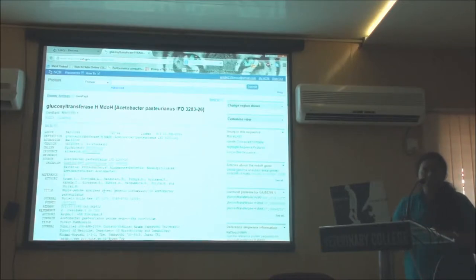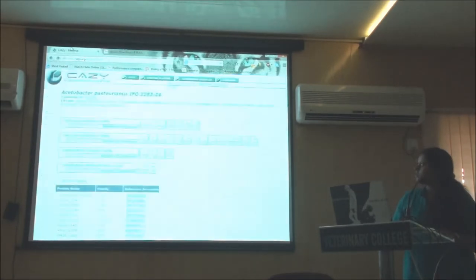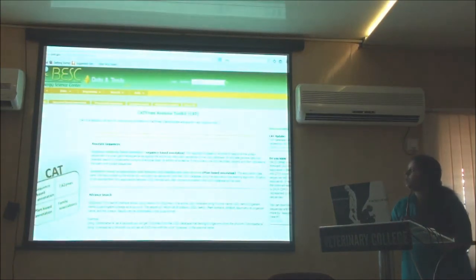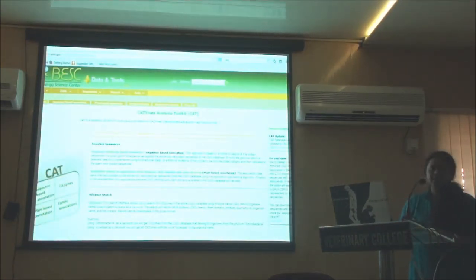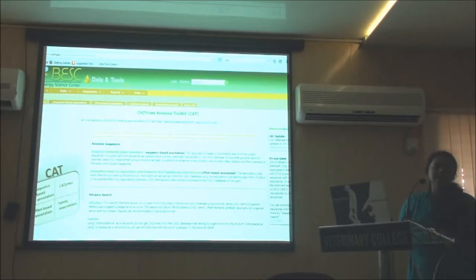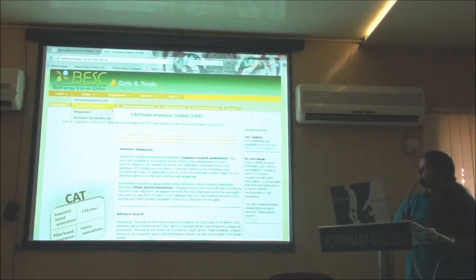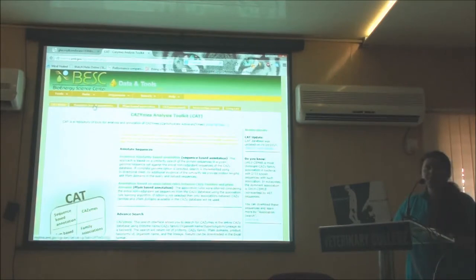Overall, CAZy is a very good database. If you play around with it you will get maximum information regarding any particular enzyme. We can get sequences annotated using sequence-based annotation as well as PFAM-based annotation from CAZy. The CAZy analysis toolkit is the prerequisite for CAZy annotations. If you type 'CAZy analysis toolkit,' this is the homepage. From here you can go for sequence-based annotation. There are many features: sequence-based, PFAM, CAZy search, association search, and many more.